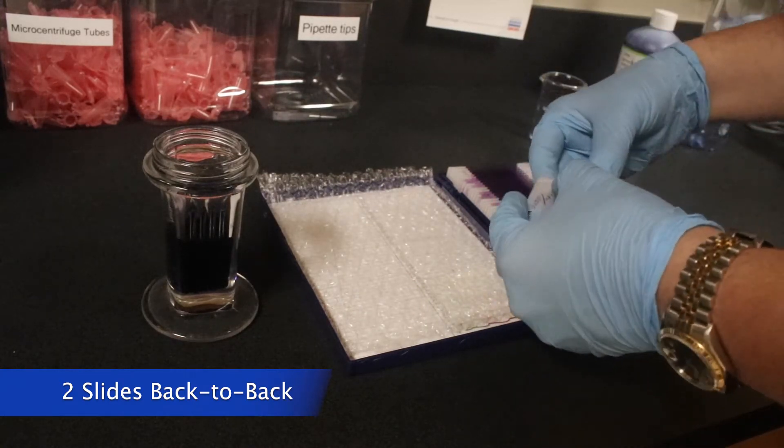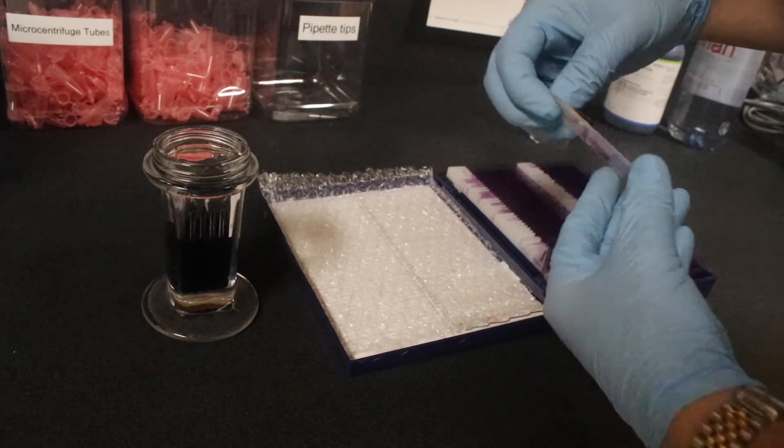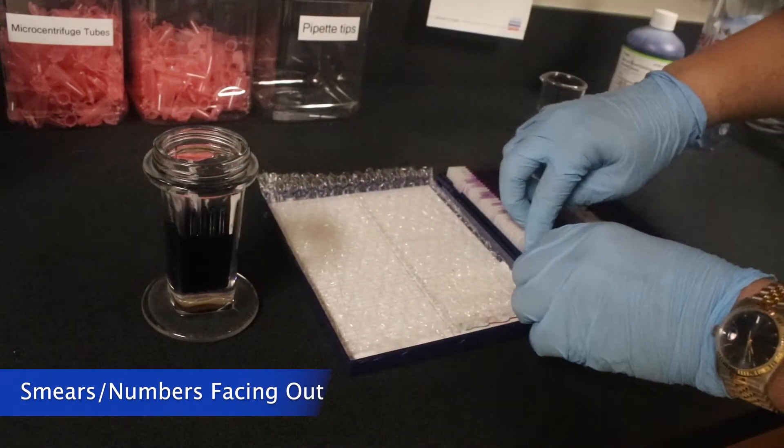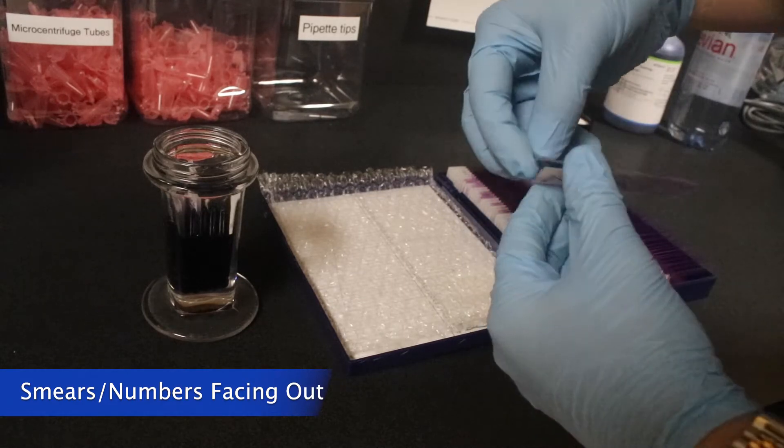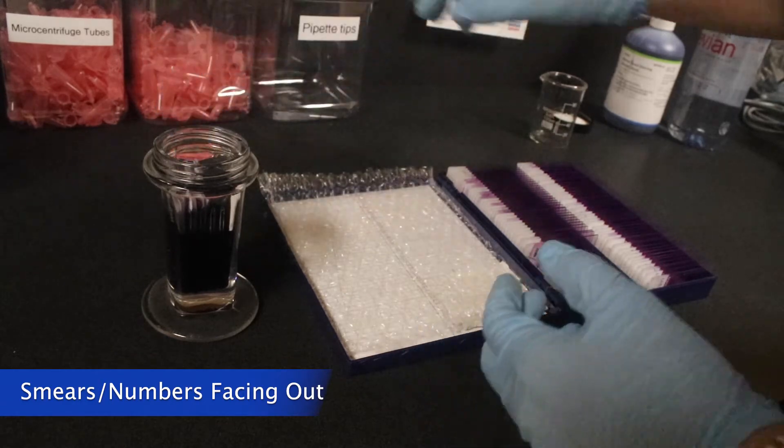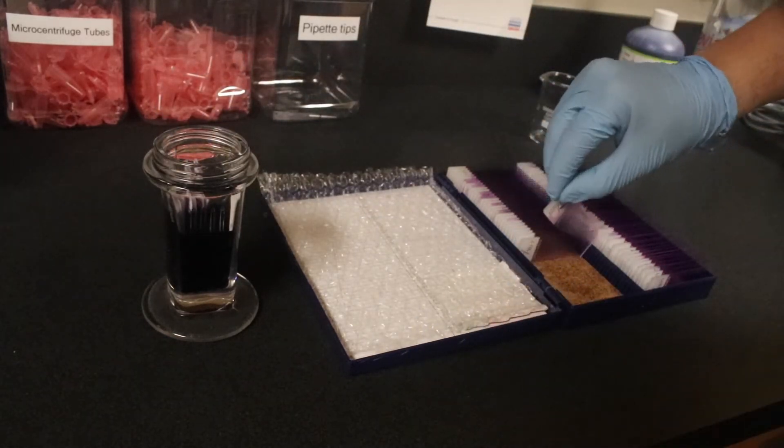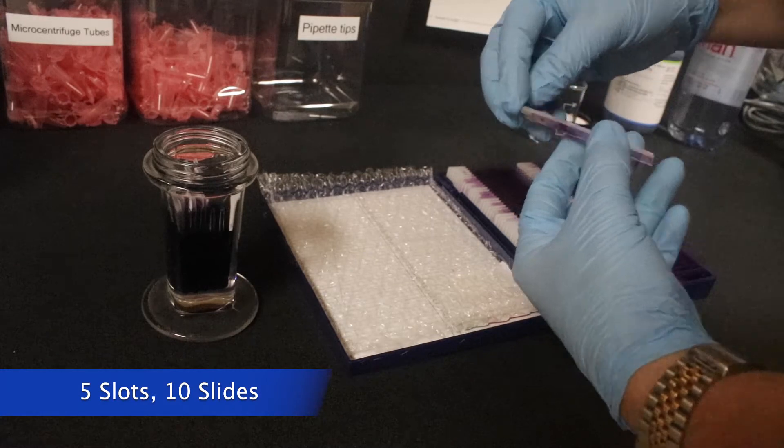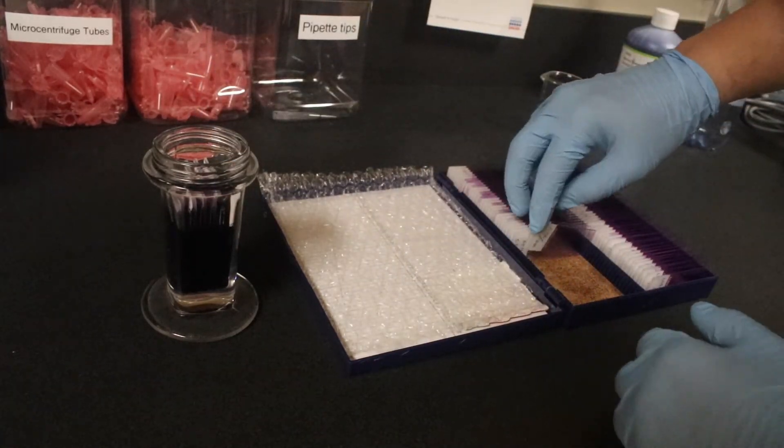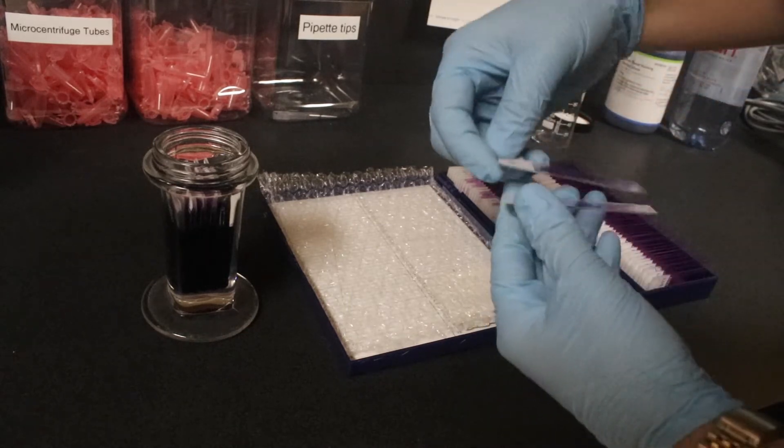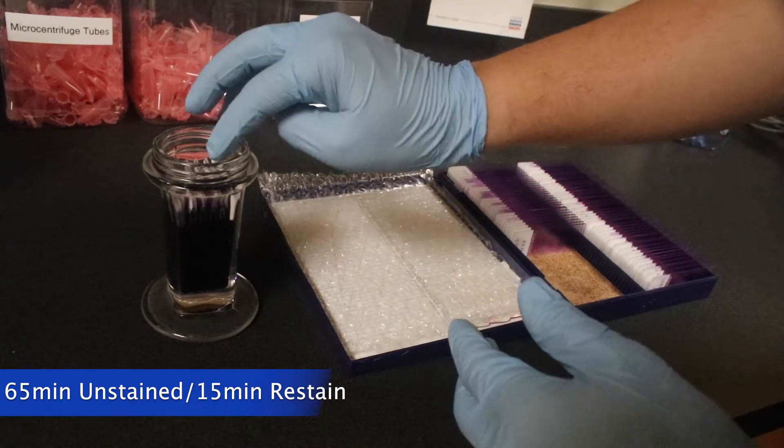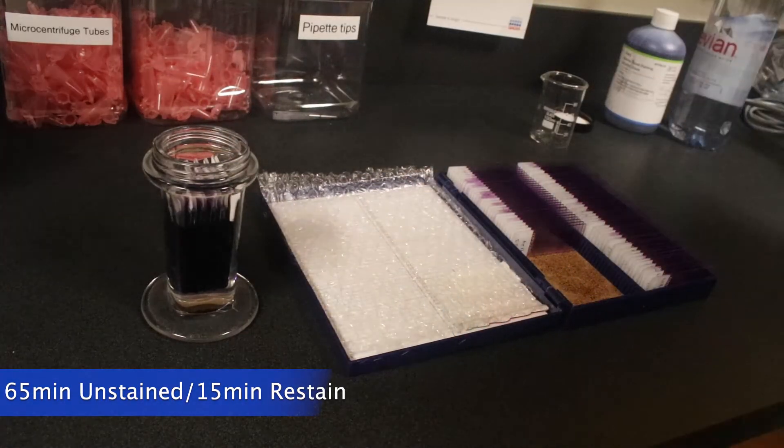So, what we do is we put the slides back to back with the smear facing outward, the smears of both of them facing outward. You want the numbers facing away from each other so that they can get stained, and you fit them all five slots, 10 slides, and you're going to leave them in for either 65 minutes for an unstained slide or 15 minutes for a restain.